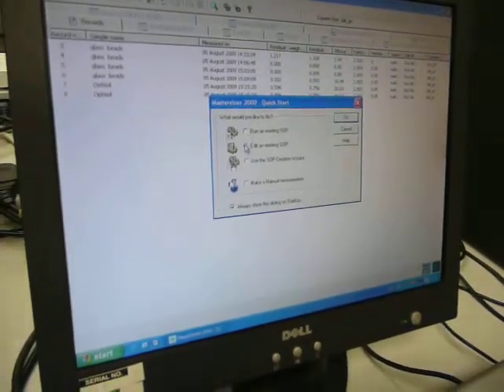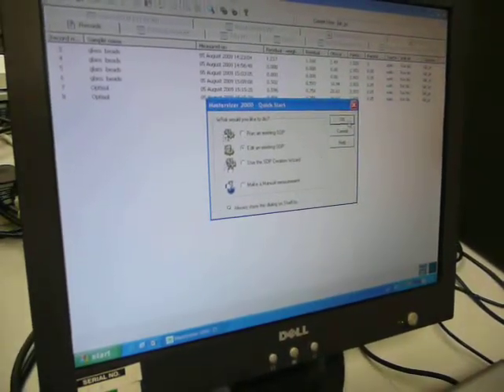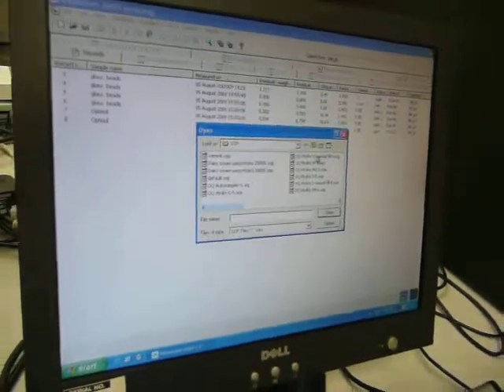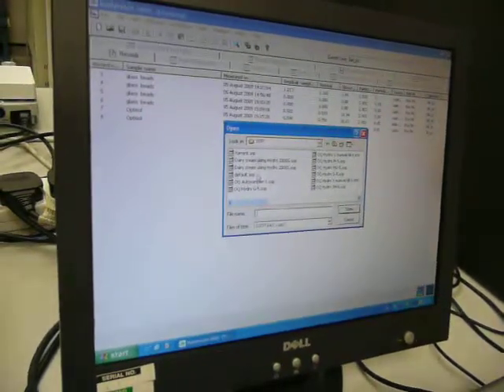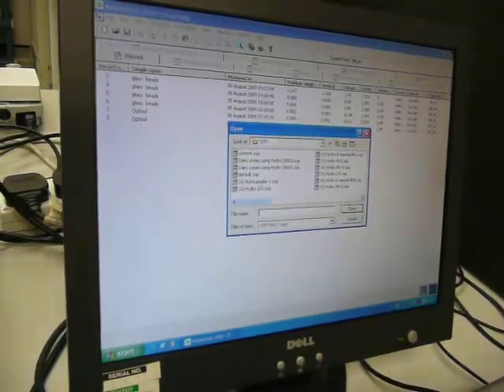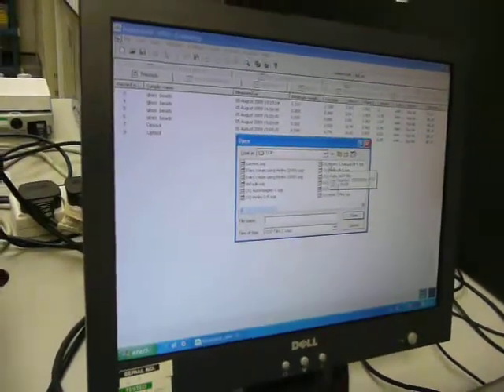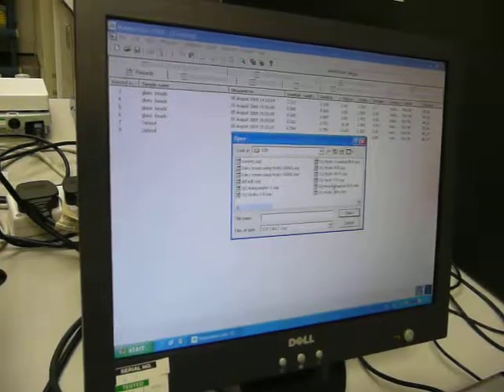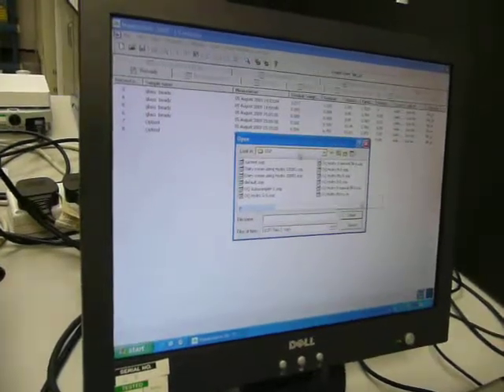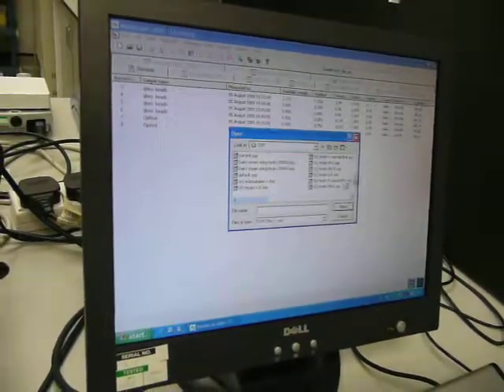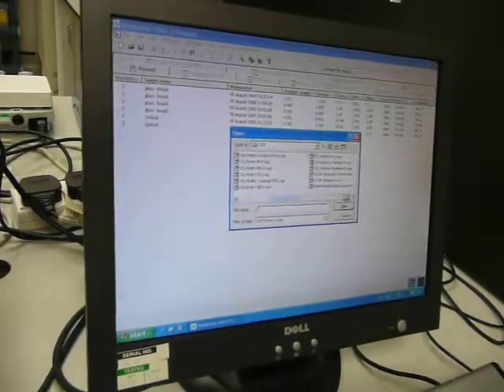For example, in the file, once you install software, you will get the folder in that test, for example, and this one.